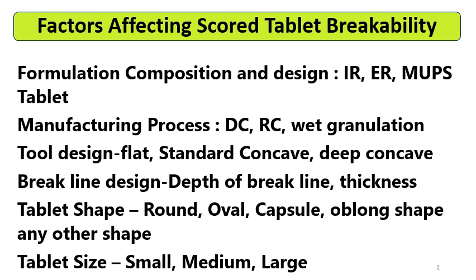Now you will understand that the MUPS formulation contain tablet formulation with pellets. So if you break the tablet and the pellets, if these are lost, then it will add more amount to the loss in weight. So the 3% criteria will be very critical for MUPS type of formulation.